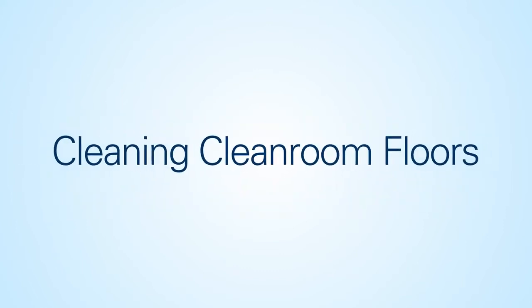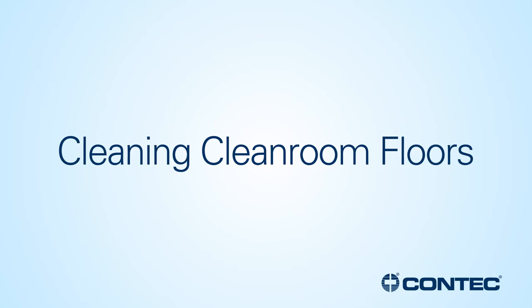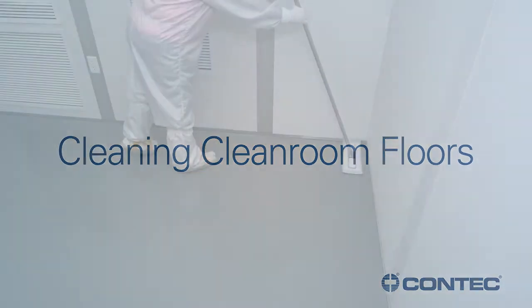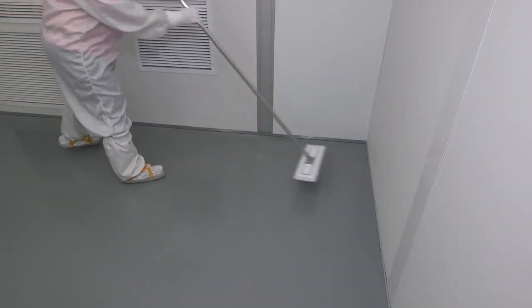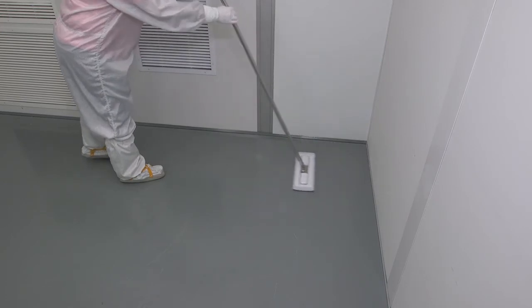In this video, we will demonstrate cleaning and disinfecting clean room floors. Always follow your facility's protocol. To clean and disinfect clean room floors, use a single-use mop with a prepared cleaner.